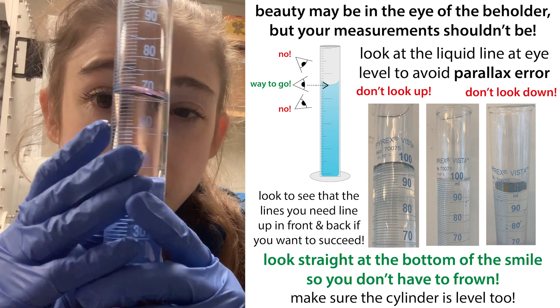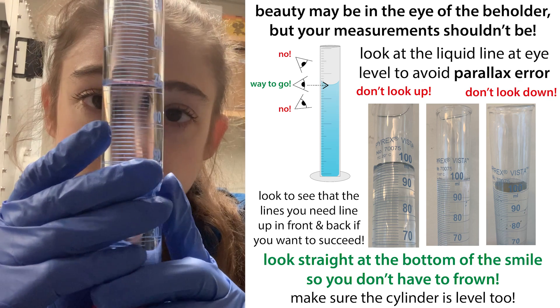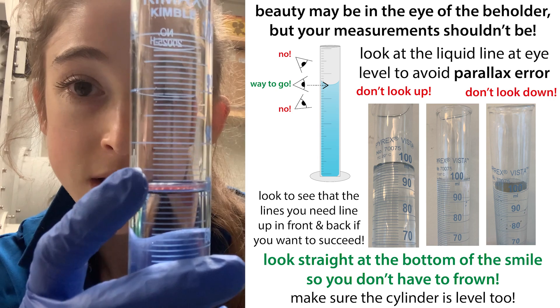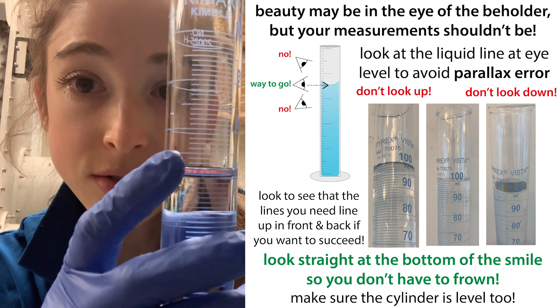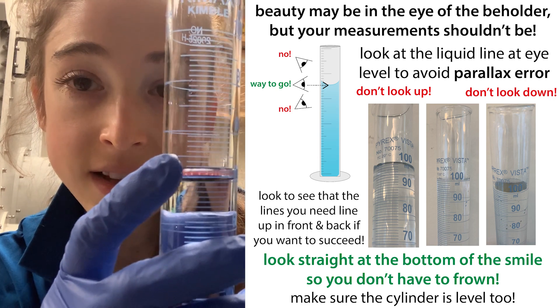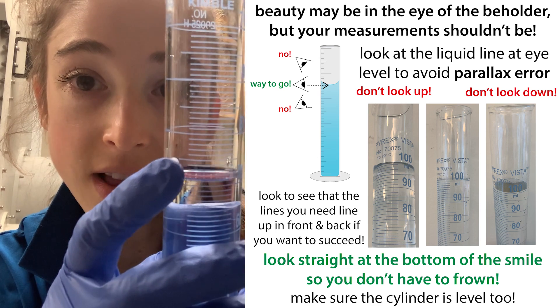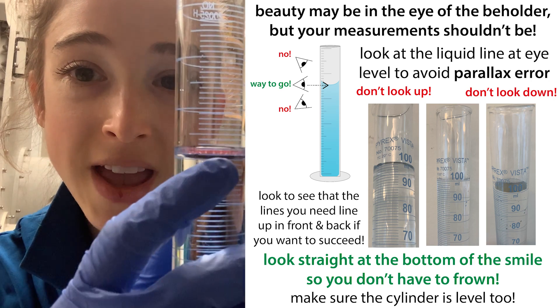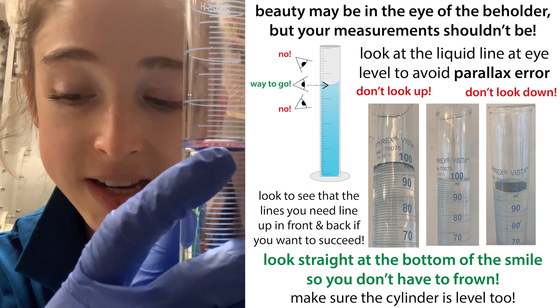What I like to do is turn the cylinder so you can see the lines go all the way around. You can line up the lines so that they stay together. You can see that here you're not level, here you're not level, and here now you can be level. And you read the bottom of the meniscus.